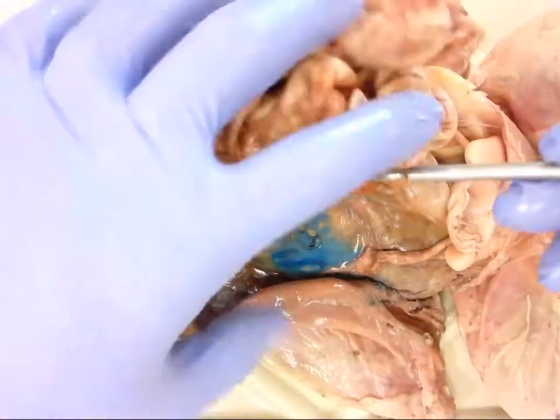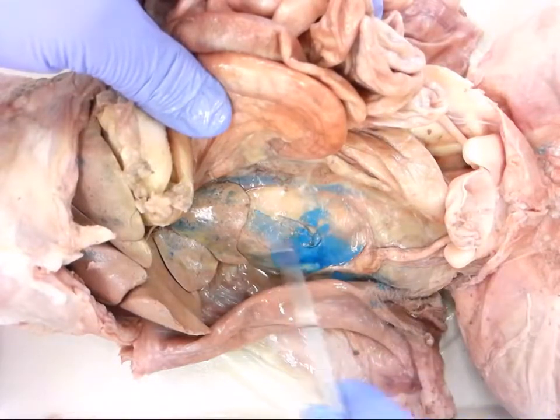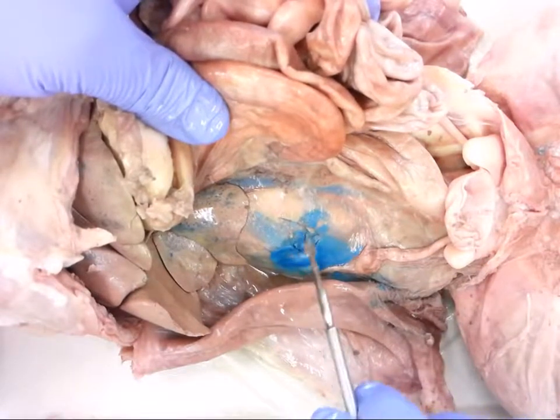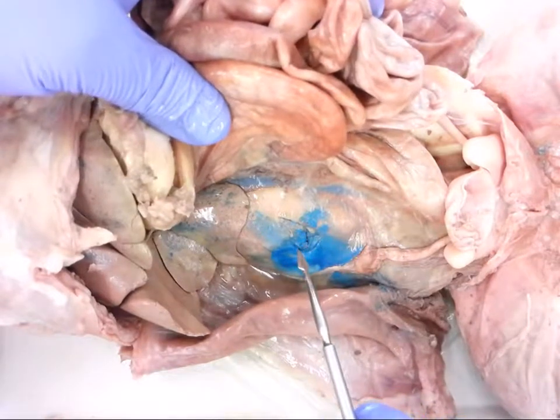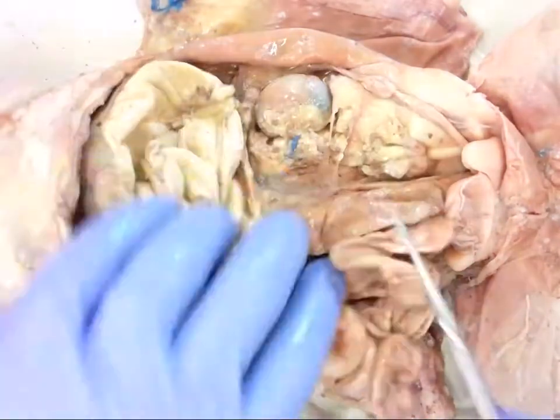The other side I've left undissected, and you'll see that this one sits encased in some membranes. It's very well covered and surrounded, but in this one the latex it was injected with actually ruptured a vessel and spilled out. So it's not a great view on this side. It's usually the easier one to find, but because of its condition I'm going to go back to the other side.